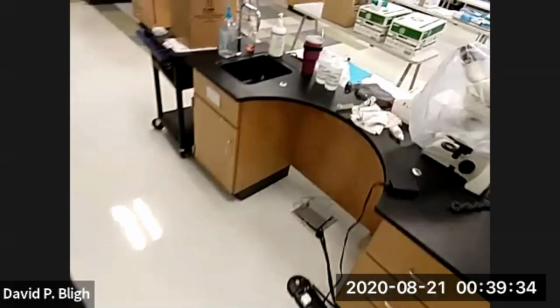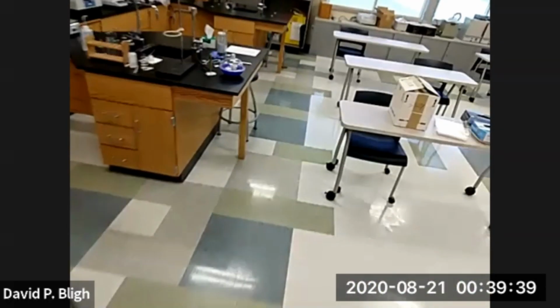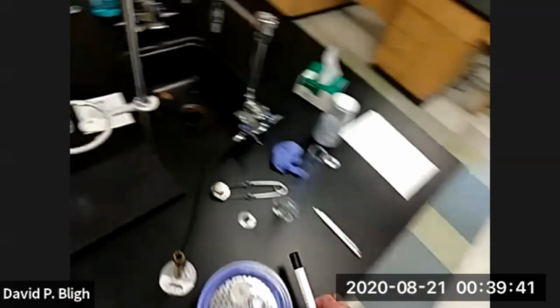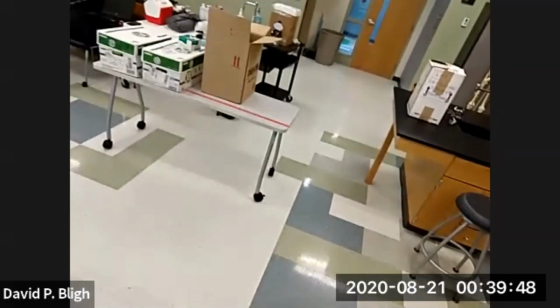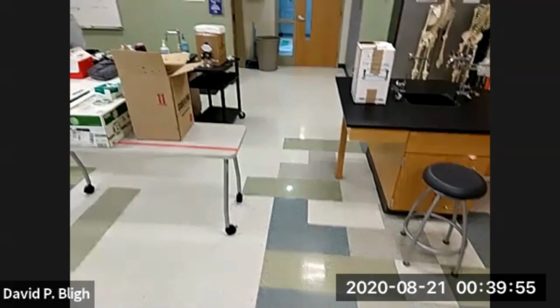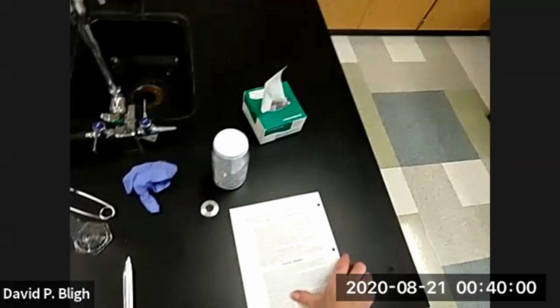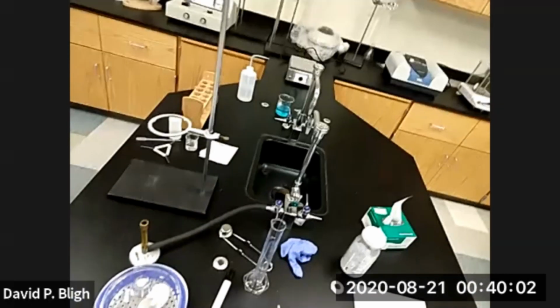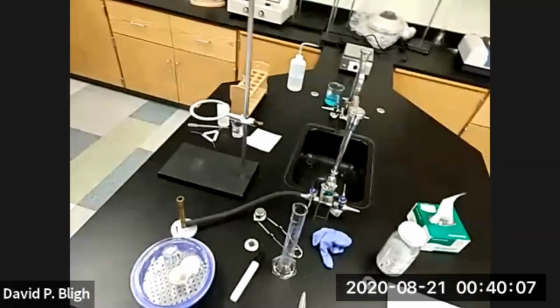All right, so we have all the information we need. We've done the fizz test. This experiment is complete. Now it's up to you to generate a formal report. And what I'm going to do is when I stop this video, I'm going to take a photo of that board. So I'll have the data. And you can extract it from the video. All right, we're done, except for cleanup, right? You have to clean up.